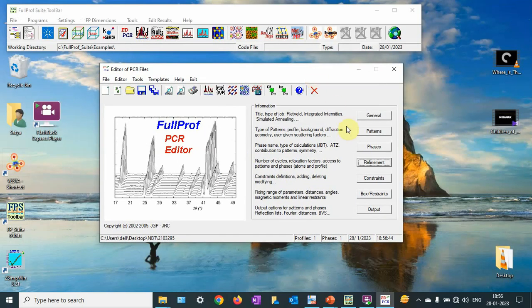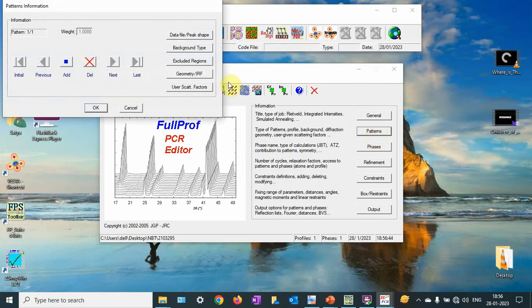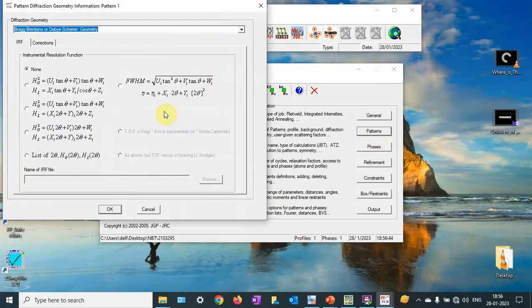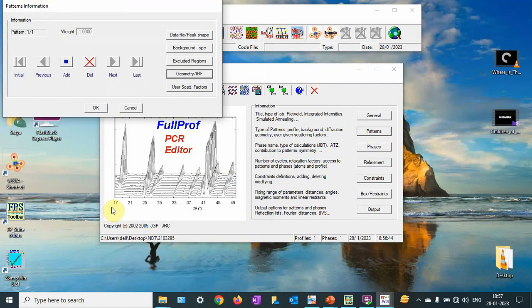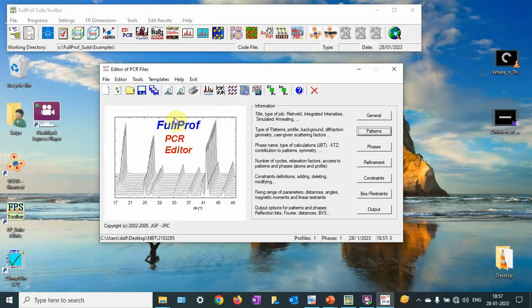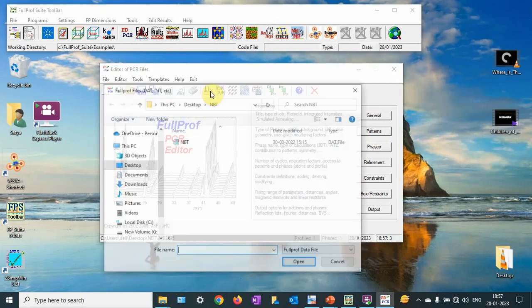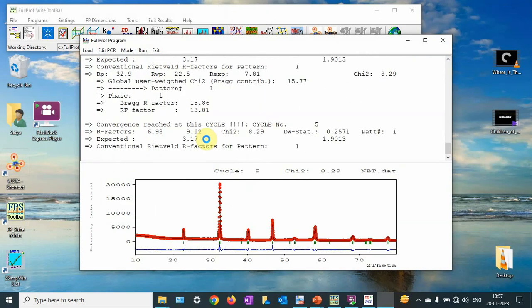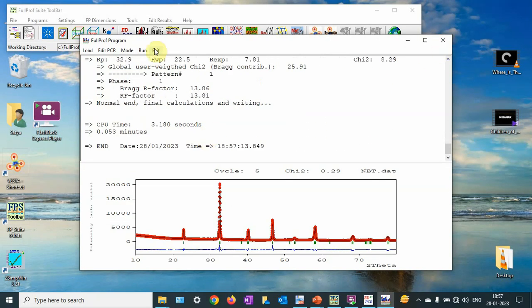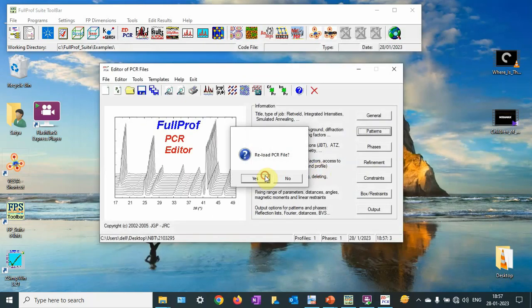Now let me import the IRF file. Go to Pattern, then go to Geometry, then select the format and browse. Go to LaB6, and this is fine. If you want to run it, run it — it will converge, and you can get even better Rwp values.